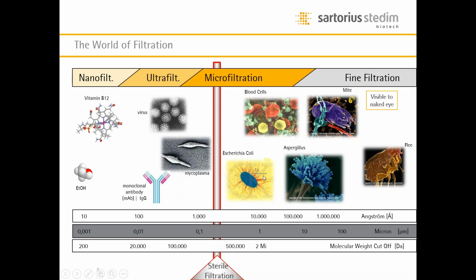When it comes to smaller organisms, and there may be also some specific bacteria like mycoplasma, viruses, monoclonal antibodies, but also small, larger molecules, smaller molecules, then of course we have to apply different technologies. So this is a really small filtration step within the whole range of different particles and molecules and living organisms to be retained from any liquid.